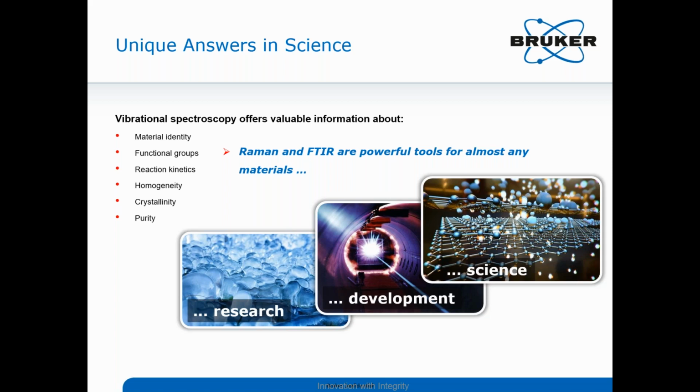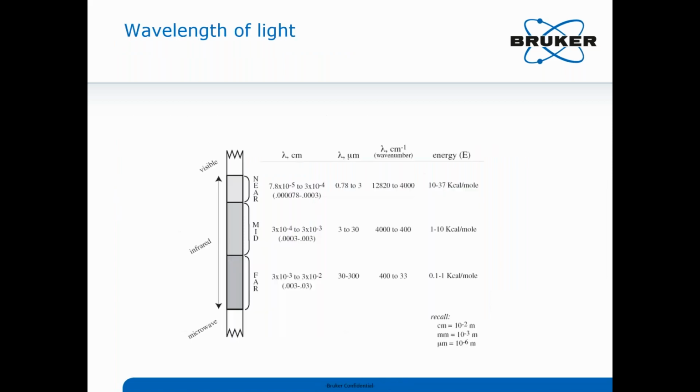Some of the places where you can see these techniques employed every day are in R&D, development, science, as well as in quality control, looking at a product that may have a defect, or maybe a food product that has a particle in there that is not supposed to be there. One of the most common is in food products, there might be a bone or something that is not so palatable from the customer's perspective.